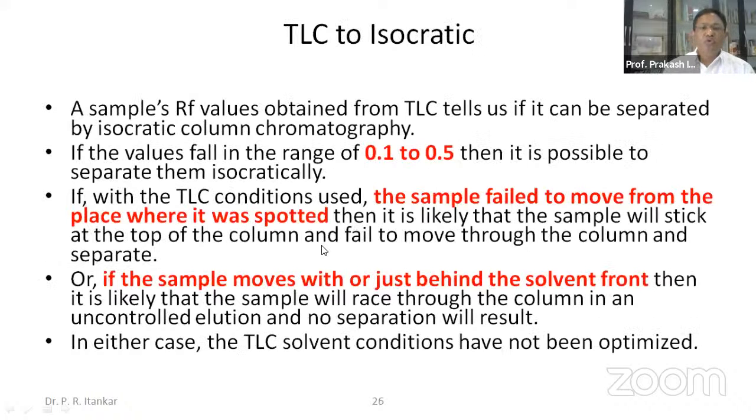And if you really wish to now connect the TLC right up to column chromatography, then the data that is generated out of TLC is very important while you fix the process parameters for the isolation in the flash chromatograph. Now, what are those examples? So I'll just simply spell out those conditions which ideally set the whole program of separation in the flash chromatograph.